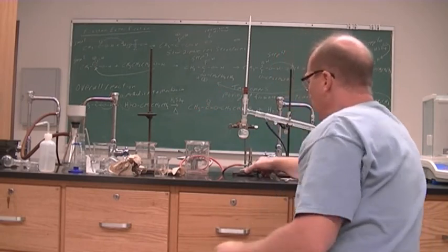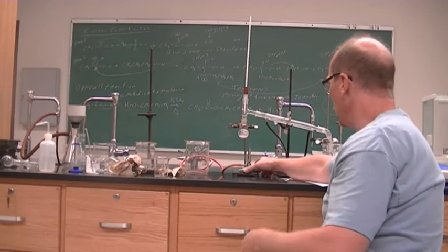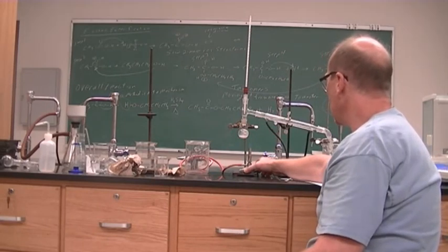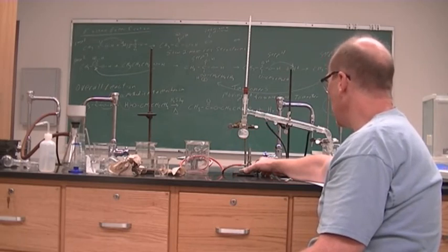Yep, so there's the bumping. So you see the popping of the white going up on the sides. We definitely don't want the white to come over. So if our product has white in it, that would be not good. It's not what we want.